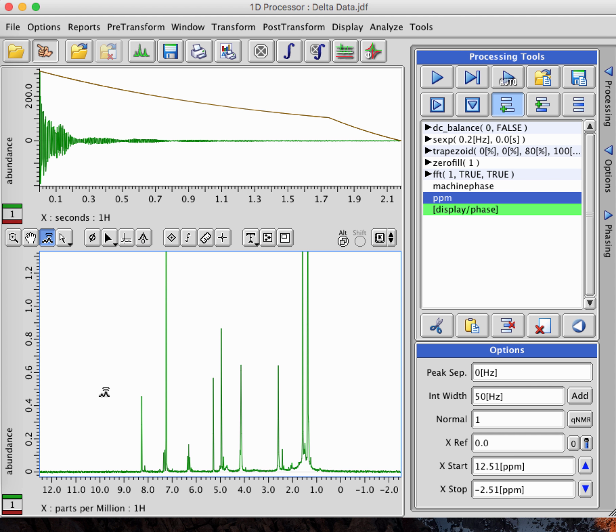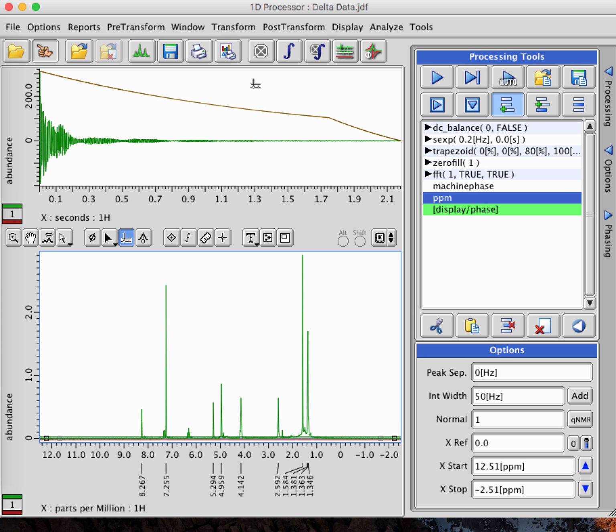So what I'm going to do is hit this icon, and when I come over here to the side, you can see how that looks like a little noisy thing. I'm going to raise that up. And once I raise it up, if I hit this stop icon again, you'll see that only those that are at that point and above, it picks up as a peak. Okay? Well, I actually do want all of those to be picked up. So I'm going to put it back down and reprocess it.